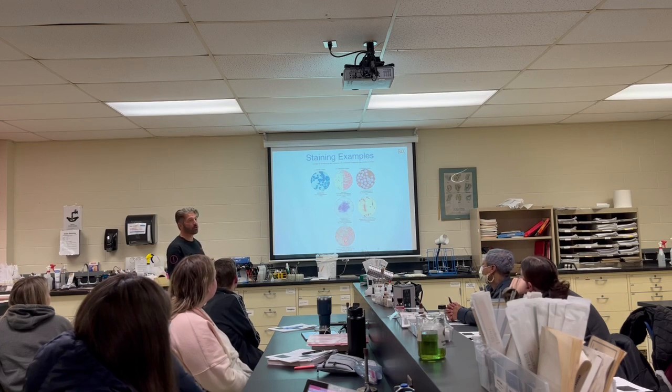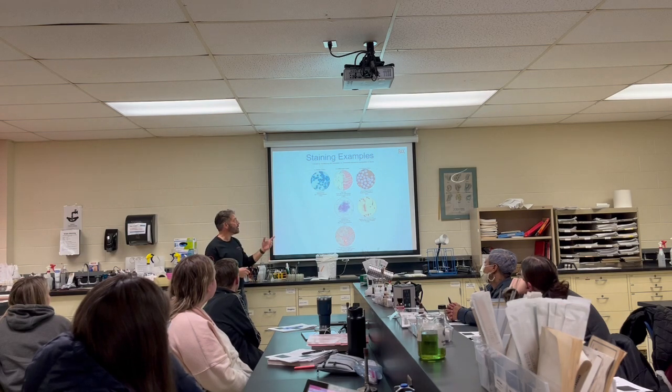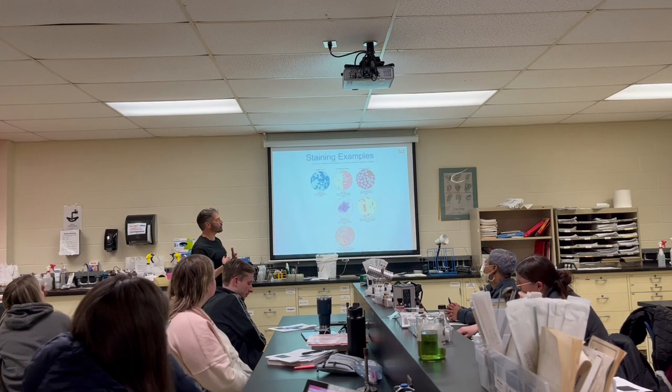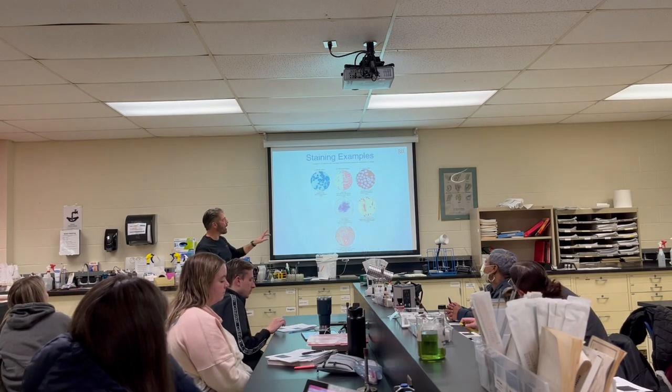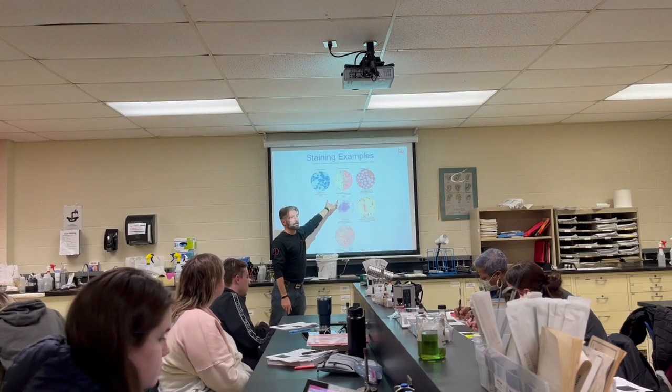Later on today, we're going to get into the gram stain, right? And I will expect you by your midterm to know the gram stain procedure. It's not that hard. I'll let you practice it, I promise. And then on the right, can we all agree that's pink or red? All right. So that is gram negative. And we'll go over the cell wall structure of that. So from now on, purple are gram positive, pink or red are gram negative.